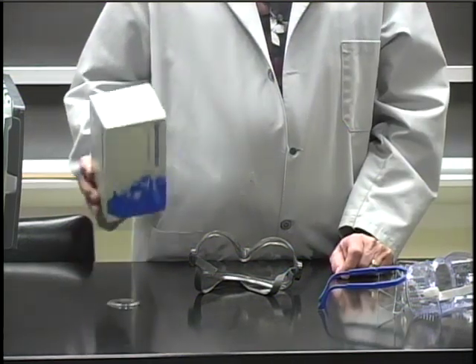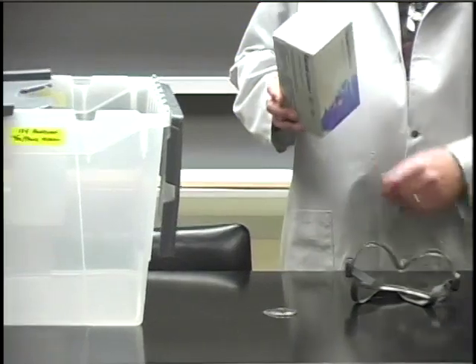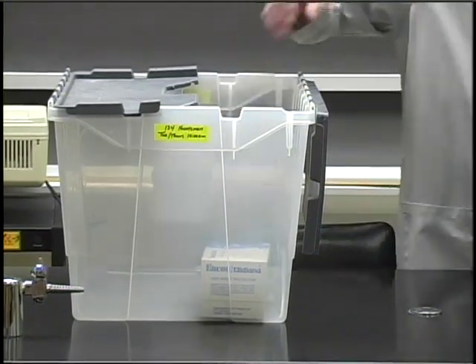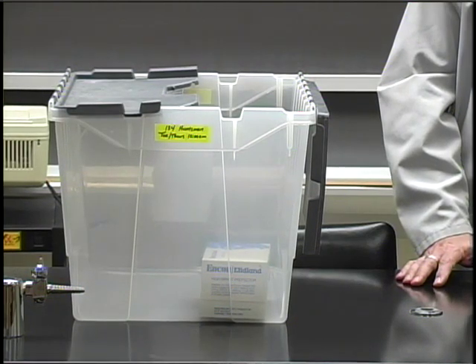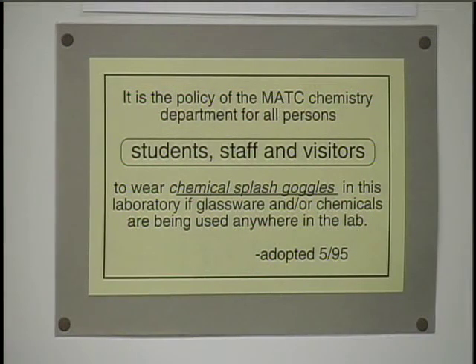If you buy them from the bookstore, you can keep the box that they come in and we will store them for you in the lab if you like, so that you don't have to remember to bring them to lab each week. If you buy goggles from any other place, be sure you check with your instructor that they're okay to use in the chem lab. The chemistry department policy states that safety goggles must be worn by everyone in the lab whenever anyone in the lab is using chemicals or glassware — from the time you take the equipment out of your lab drawer until either everyone is finished with the experiment or you're on your way out of lab.